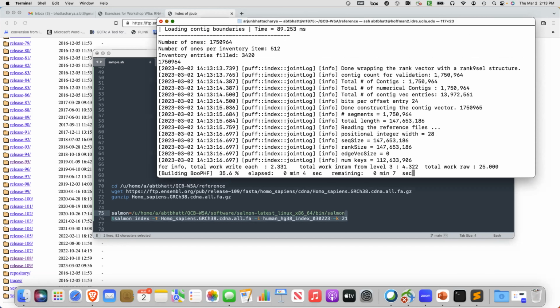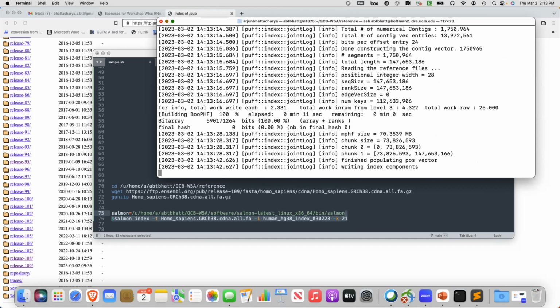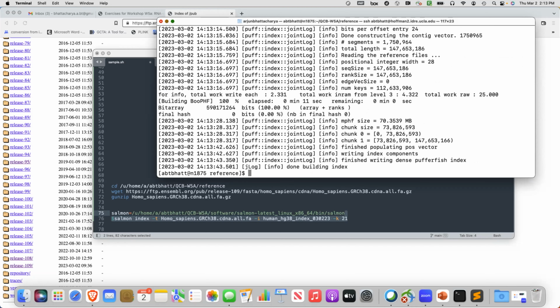It's looking for a sequence length that it's going to look at, that's then a sequence length for the hash table. This K parameter chooses the maximum length of that. So it's a little bit of an arbitrary guessing game here. Usually I've seen somewhere between 21 to 31 is a good place to be for short read RNA sequencing, around 75 to 100 base pairs. If you have like 200 base pairs, I would go to like 31.